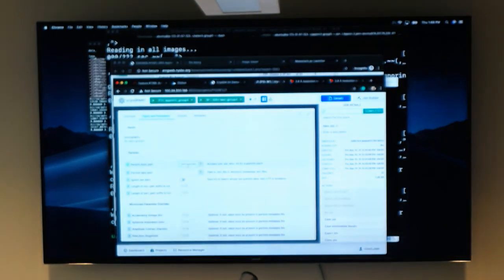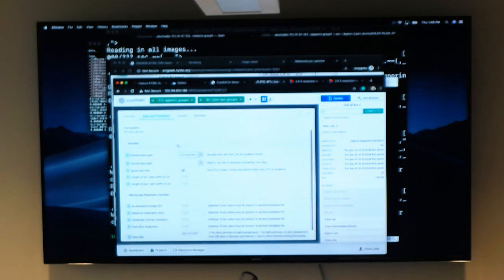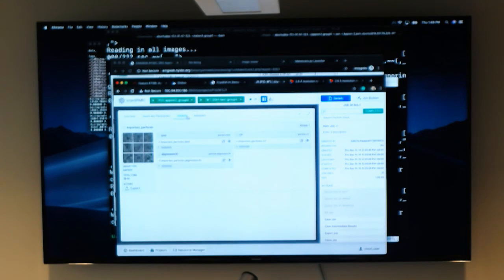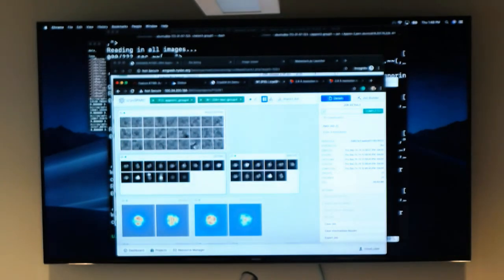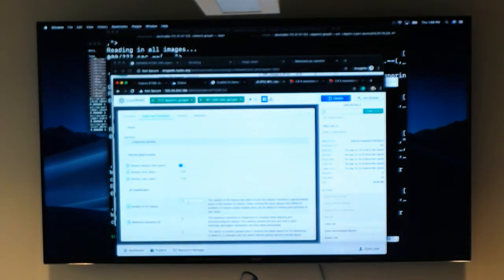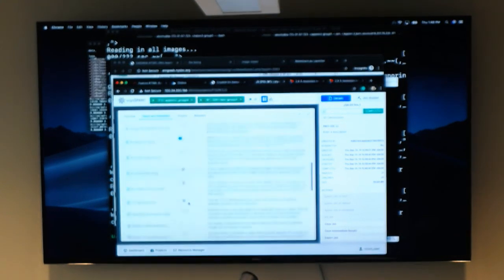Something that may also be useful is that you can always find what input you actually use in that tab, and the explicit path in anything we use. Okay, great. So then next was a 2D classification run, 20 iterations. In this case, they did 15 classes, as you can see here.